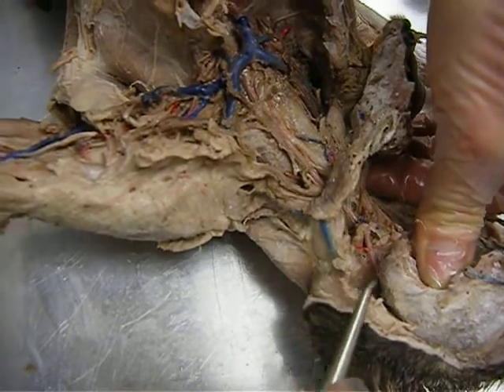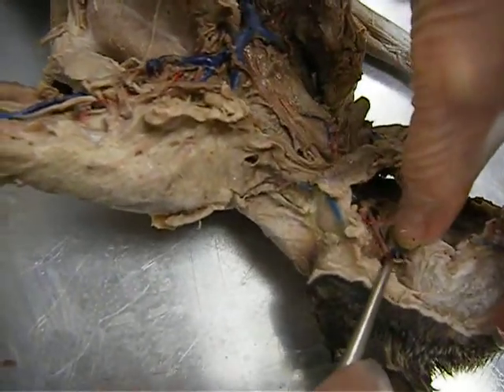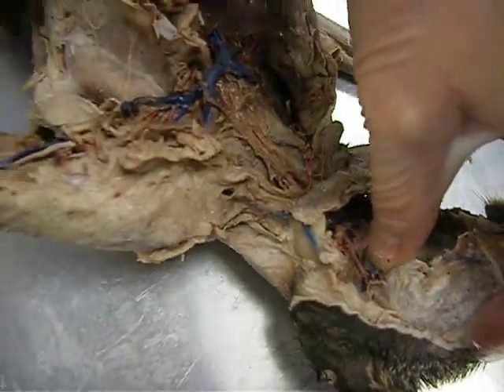Going out to the ear is posterior auricular. Then your next branch is internal and external maxillaries. This is really good.